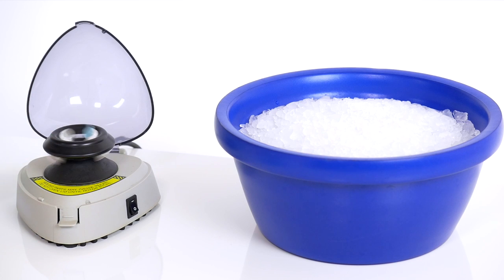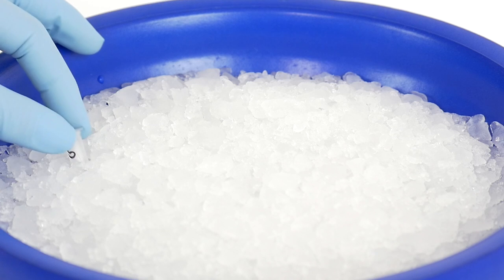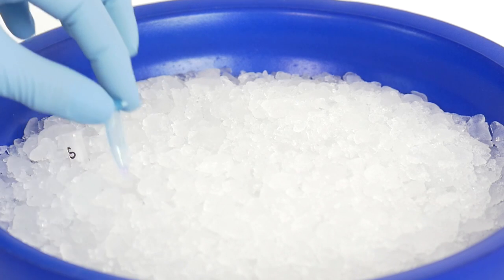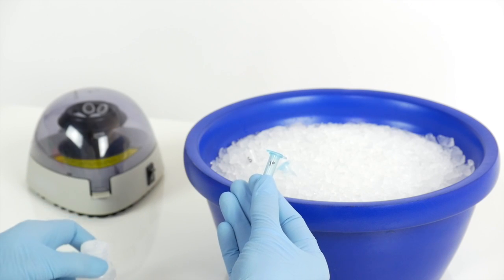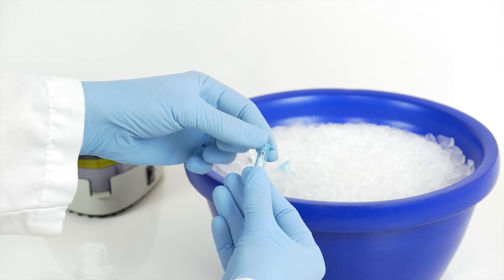Then place them on ice until you're ready to load them onto the plate. By the way, if you're using the system control, you can add 12.5 microliters of the system control primary antibody to your diluted primary antibody.